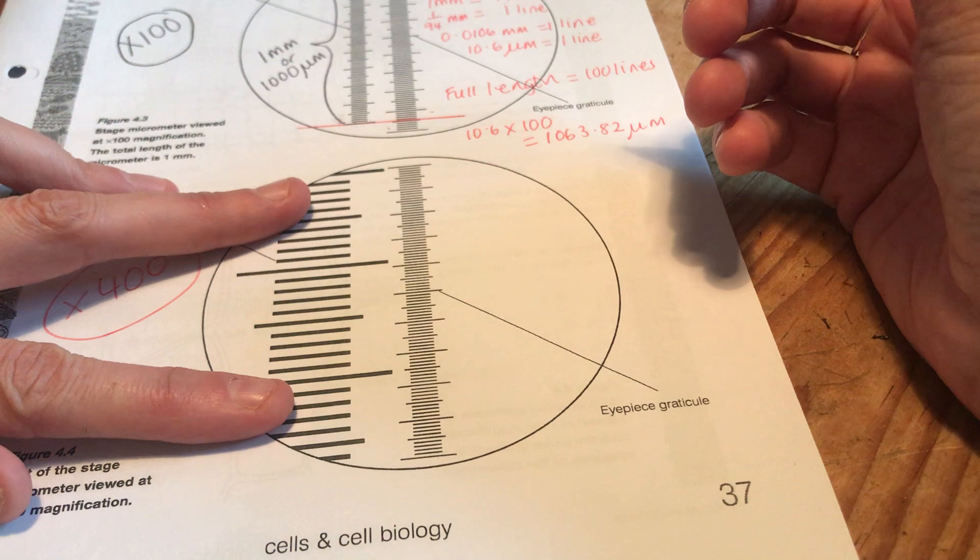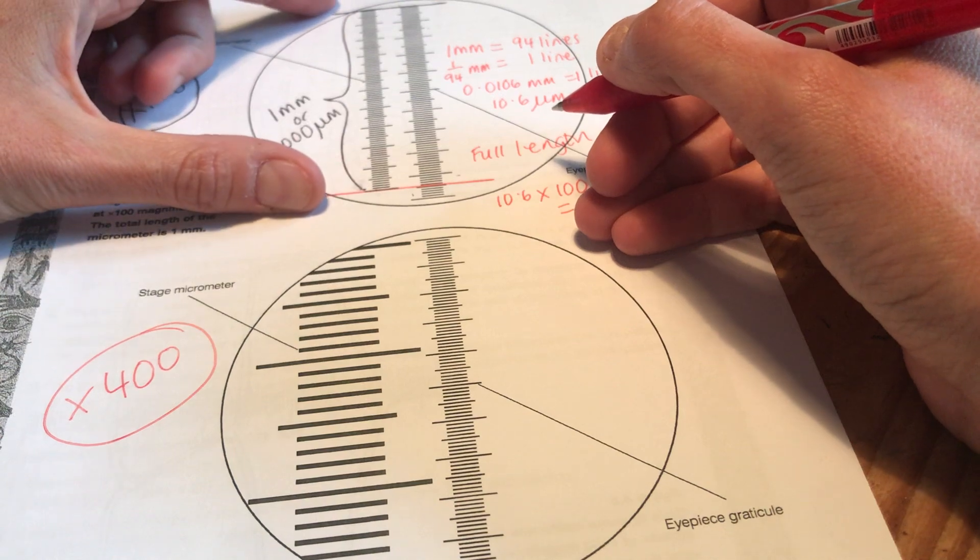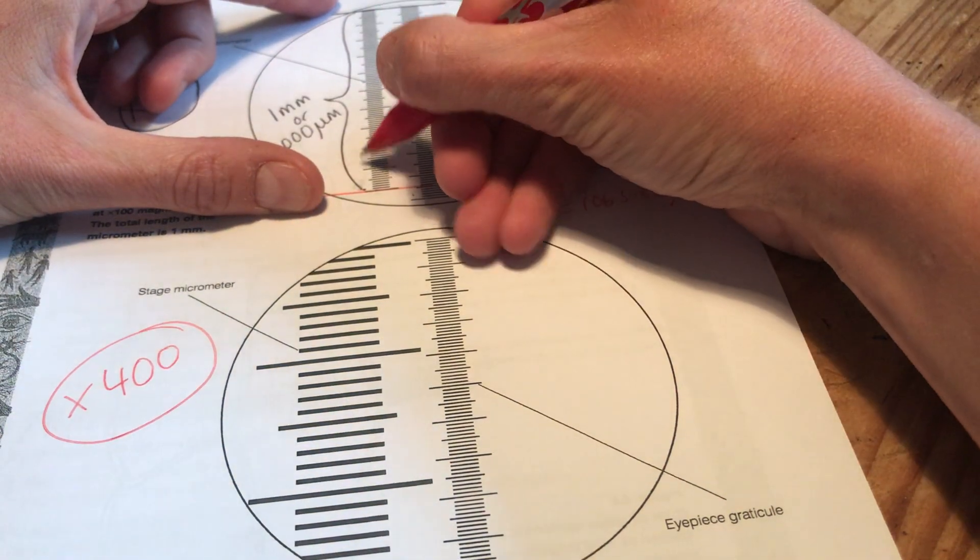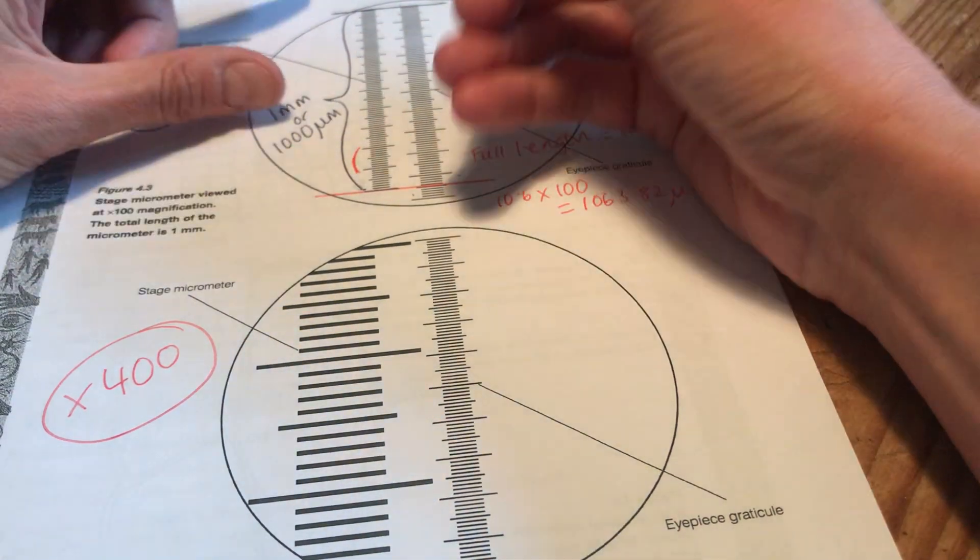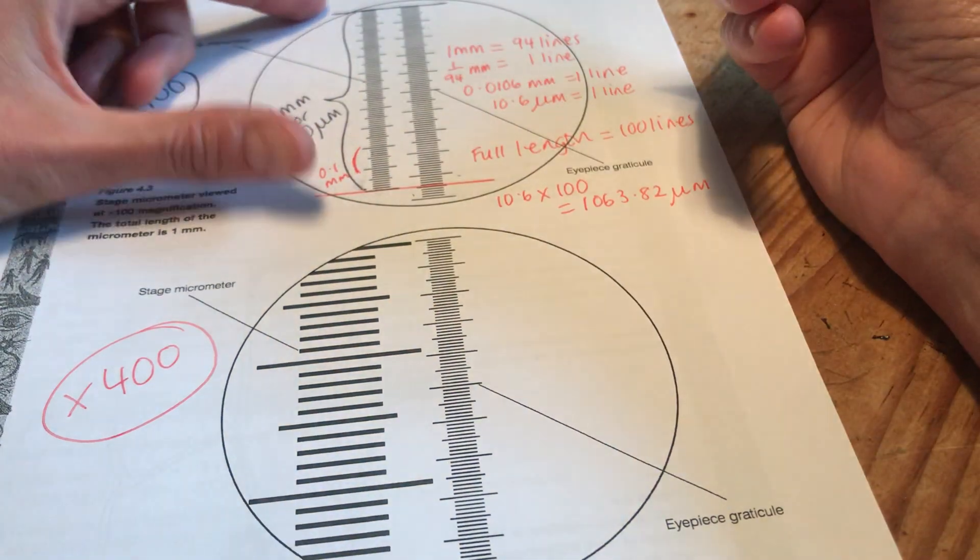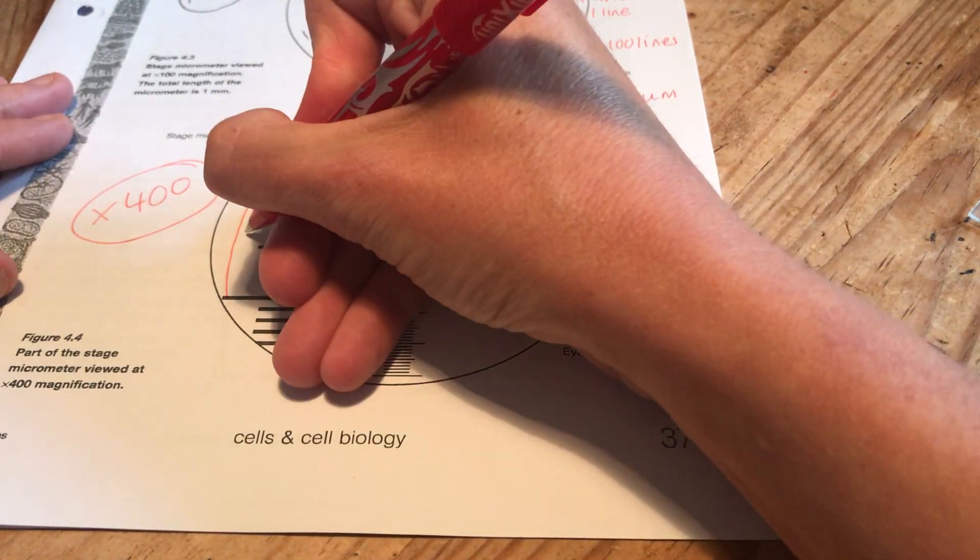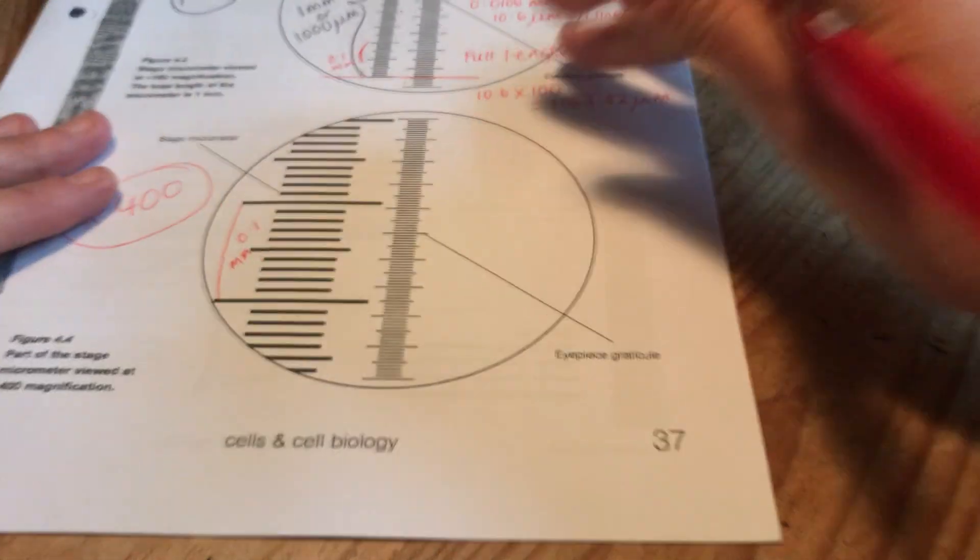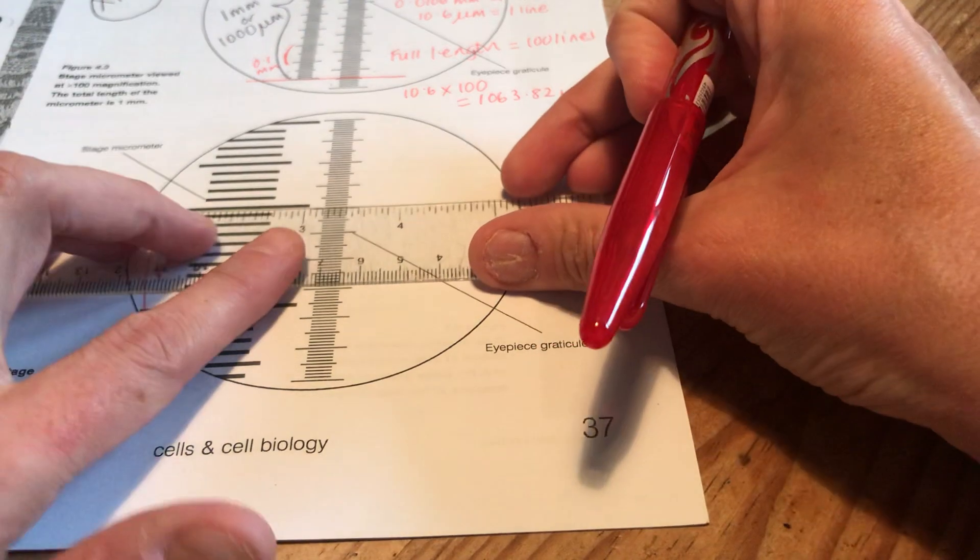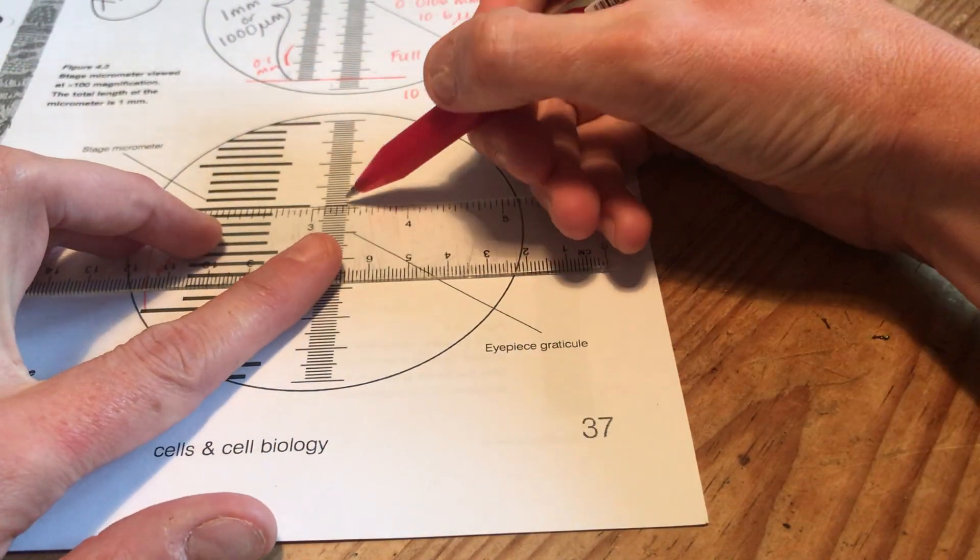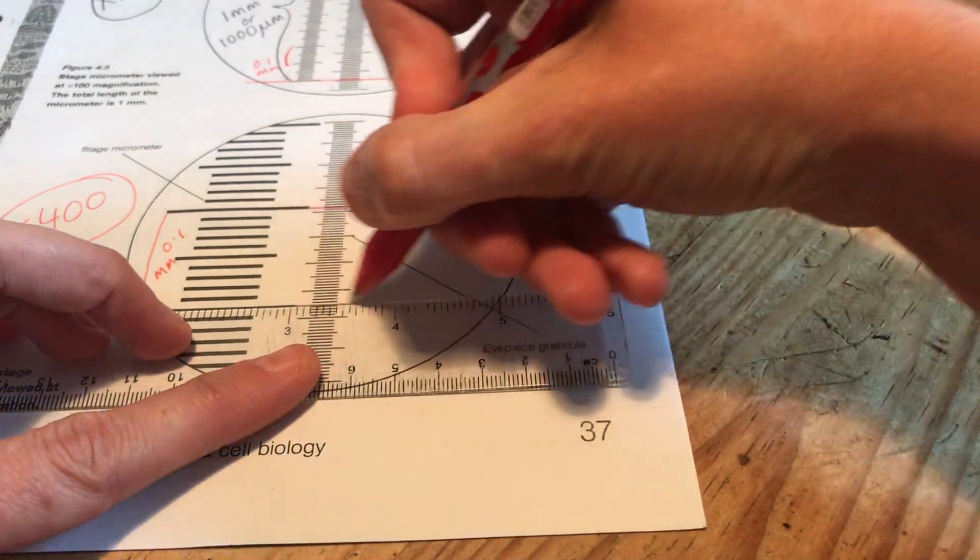So this is the stage micrometer. This is the same picture as this here, but it's been magnified. So remember that was worth one millimetre and it was actually split up into 10 chunky sections. So each one of these chunky sections here is worth 0.1 millimetre because it's a tenth of that. So that means this chunky little thing here is worth 0.1 millimetre. I'm going to do the same again, the same way as we calibrated this one. We're going to find matching lines. You can't get it perfect, especially because these lines on the left are much bigger. Let's say roughly there and roughly there.